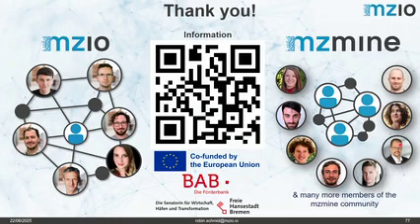Any more questions? Just for anything mzmine related?